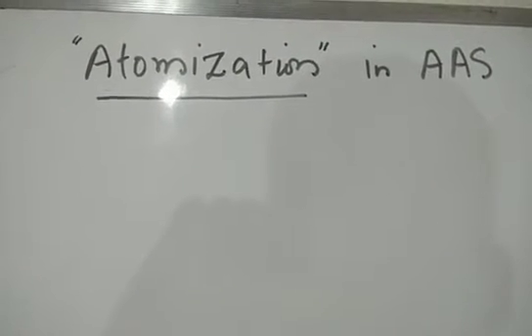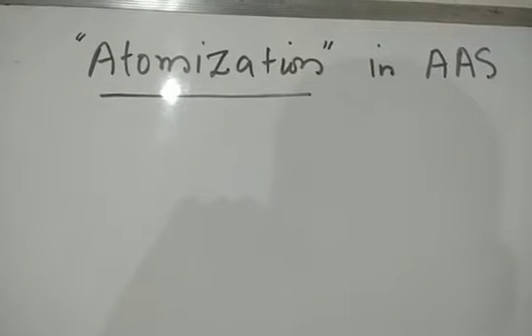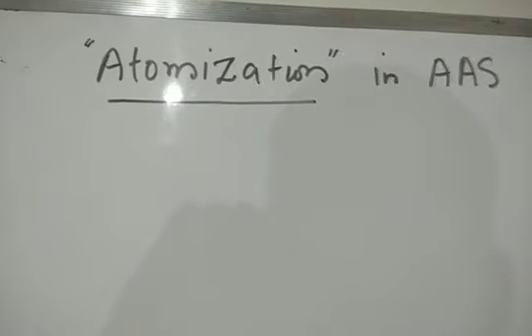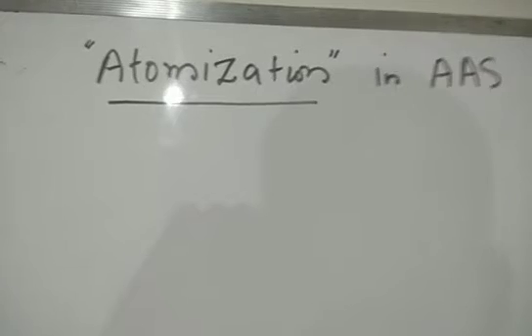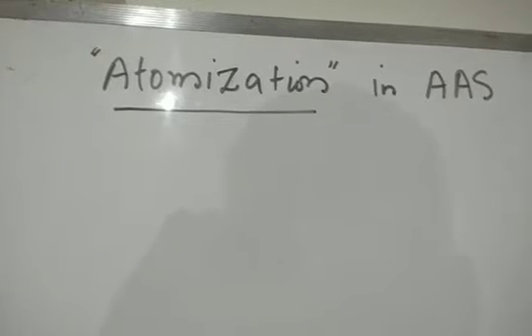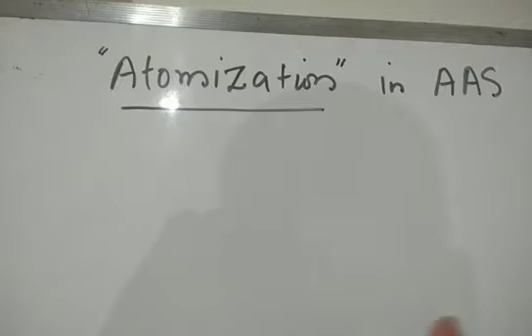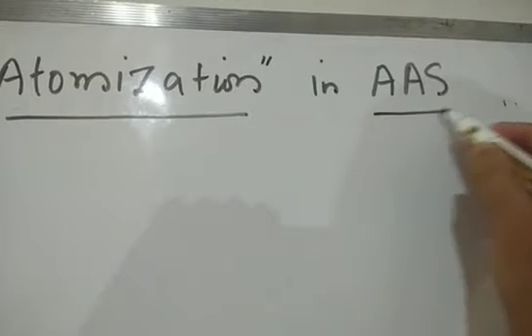और यहाँ पे अगेन मैं ये बात हाईलाइट कर रहा हूँ कि दोबारा हम डीप में इसमें नहीं जाएंगे, एक पूरी थ्योरी उठा के, क्योंकि हमारा जो पैटर्न है वो ऑब्जेक्टिव टाइप एग्जाम पैटर्न है और अननेसेसरली डीप थ्योरी में जाना शायद इस टाइम पे मुनासिब नहीं है, क्योंकि टाइम हमारे पास बहुत लेस है। एंड सो विल गो स्ट्रेट फॉरवर्ड इनटू द मेन टॉपिक्स, द मेन पॉइंट्स along with the basic understanding of the technique. तो हमारे पास जो टेक्निक हमने स्टार्ट किया that is atomic absorption spectroscopy.